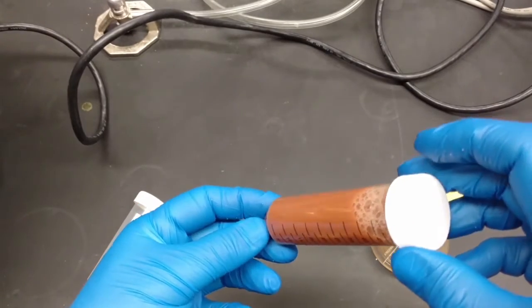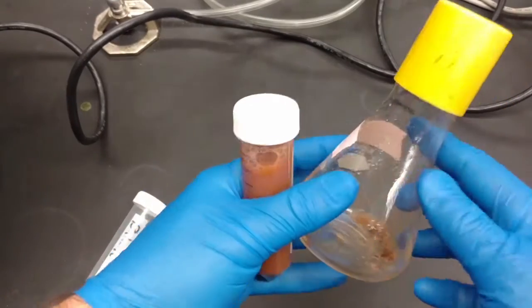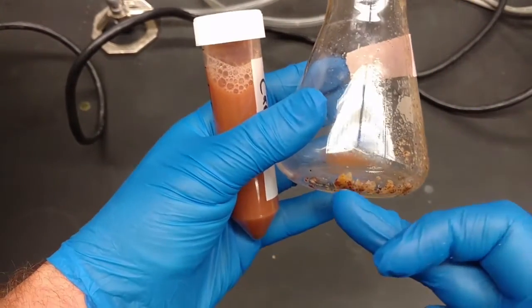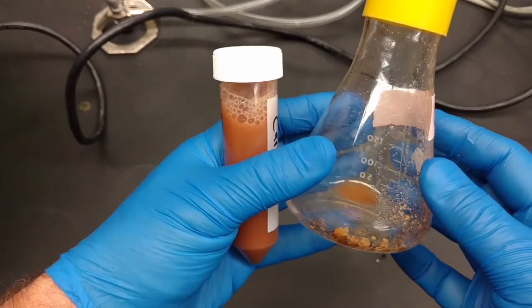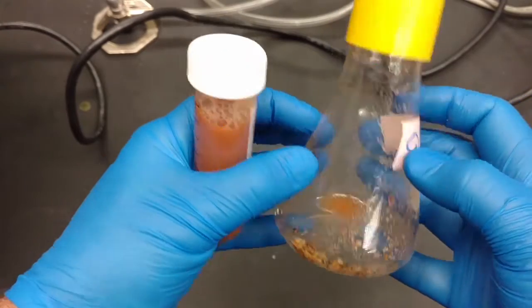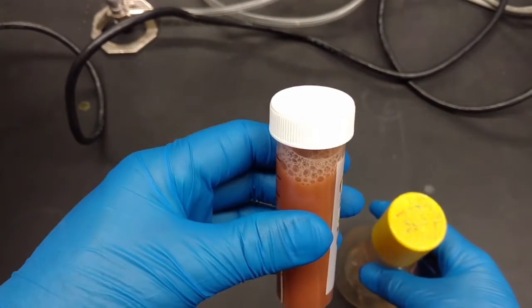We chose the volumes that we did on purpose so that they would all fit in there. The more you get of this in here the easier this is to clean, because all this crud can't go down the sink. So we're going to have to clean this out in a way that keeps it from going down the sink. Make sure you swirl it around and let it all go in here.